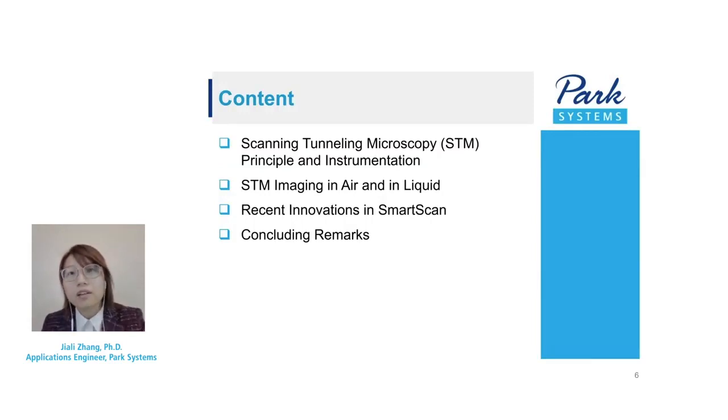Here is the brief outline of today's presentation. Basically, the focus of my webinar is to demonstrate the feasibility of STM imaging using Park Systems instruments. After that, I will slightly change gears and introduce some of the recent innovations for our data acquisition software, SmartScan, for our users' benefit.